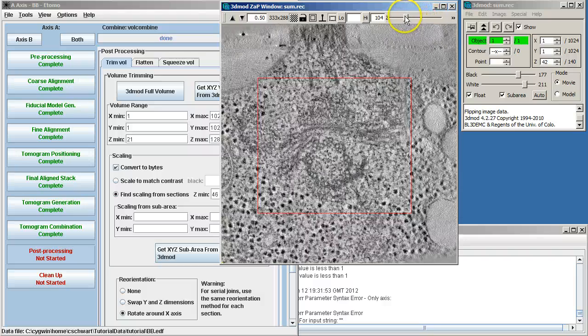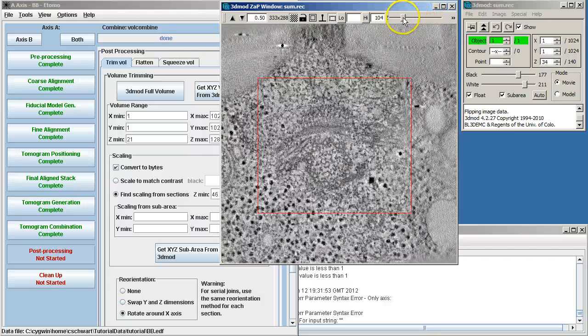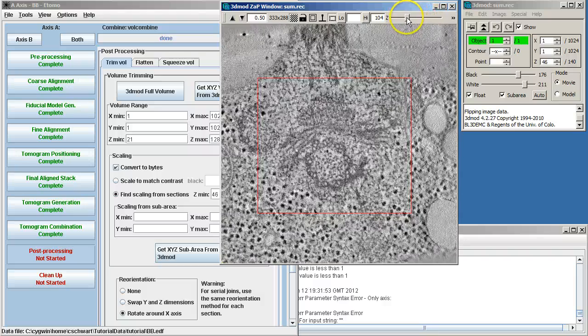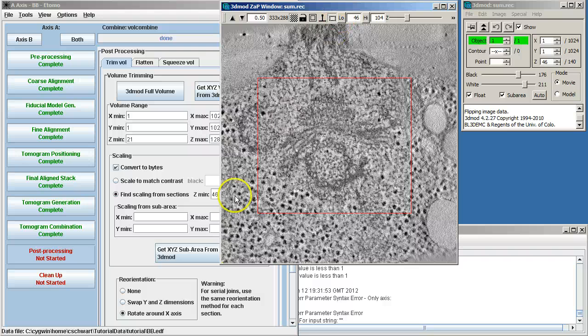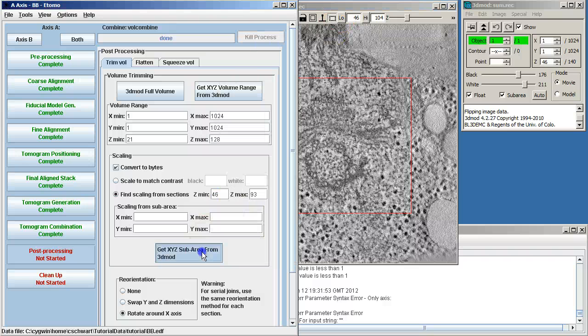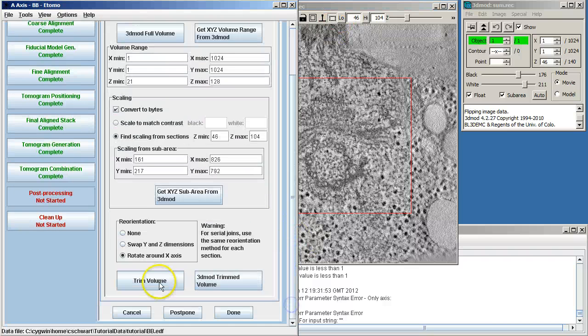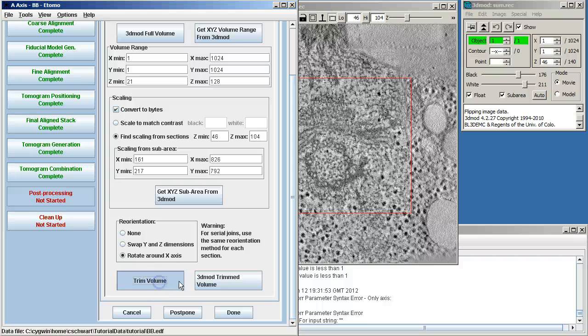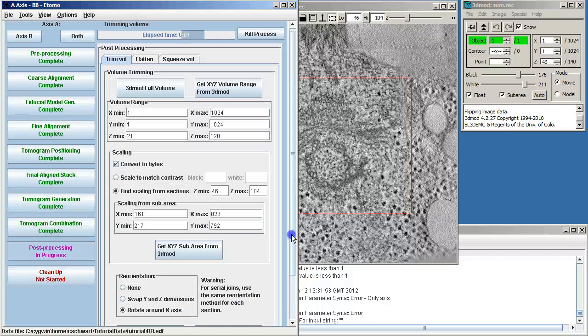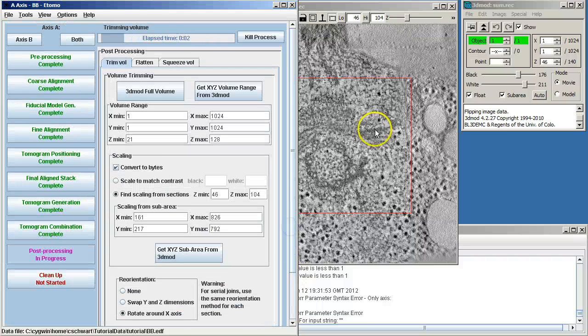And then go down. But I don't want to get any gold in the image, just cellular material. So that's my low. I'm going to select that as my sub area for scaling. If you get gold in there, it will totally mess up your contrast.